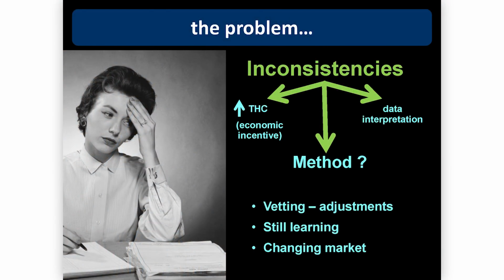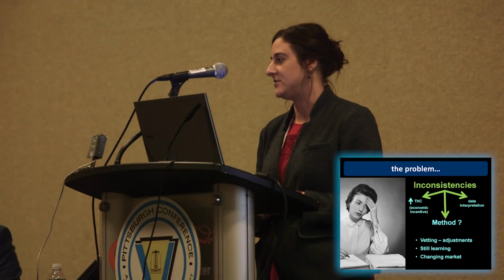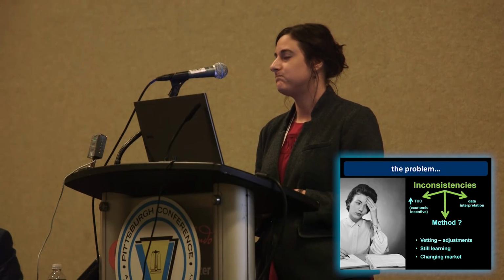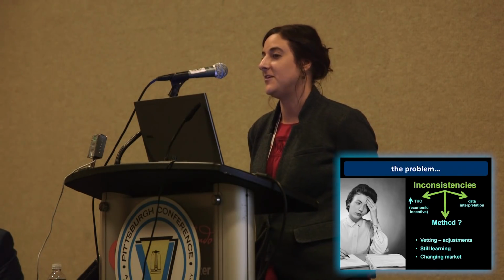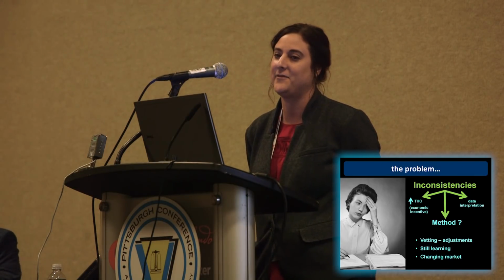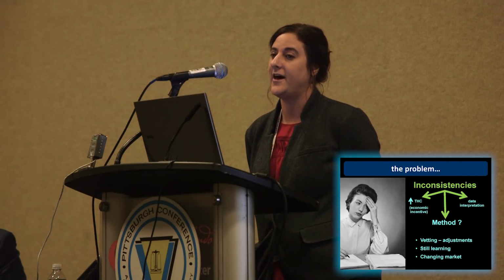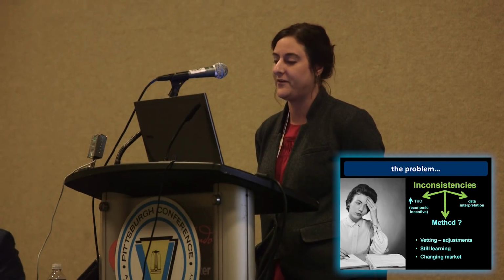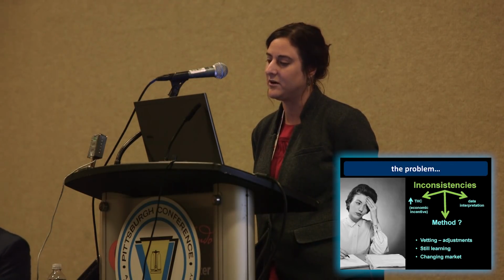Someone's already mentioned the word dry labbing, but I will say it does happen. In this market right now, for testing facilities, the product is essentially evaluated on THC content. So that is a lot of times how you get your business. For instance, we have clients that do all of their R&D samples through us, and then when they go to do their compliance labeling testing, they go to a different lab. And there's a reason for that. There's a certain portion of the market that occurs, and that's fine. There's nothing we can do about that. But that does not explain all of the inconsistencies that we see, for sure.